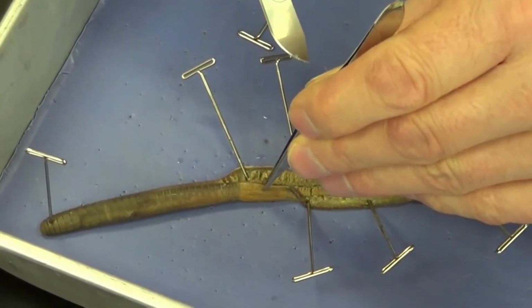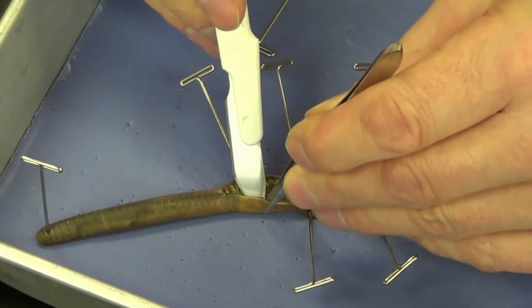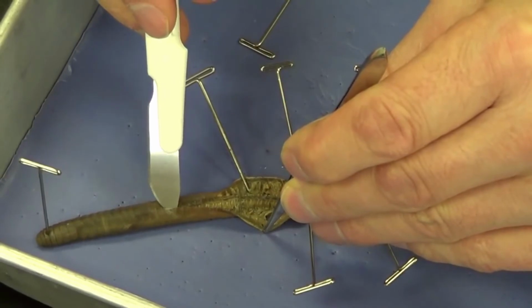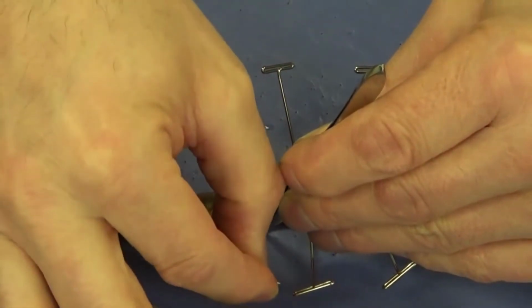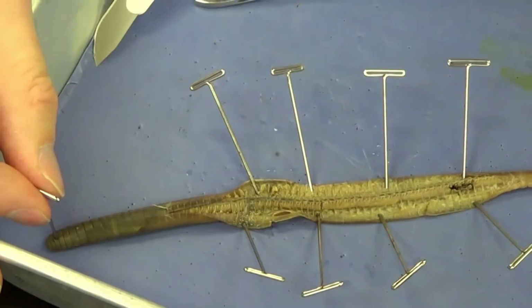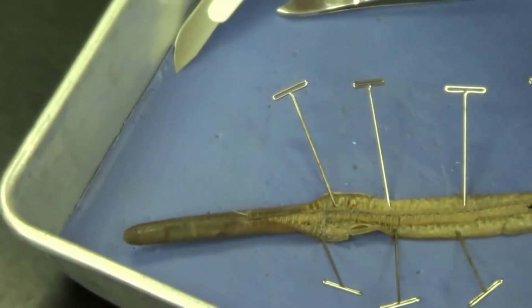I'm going to take that skin, pull it back, and cut those septa. And I'm going to work my way anterior. Now eventually, as I get close to the mouth, I want to remove that pin so that I don't bump into that.